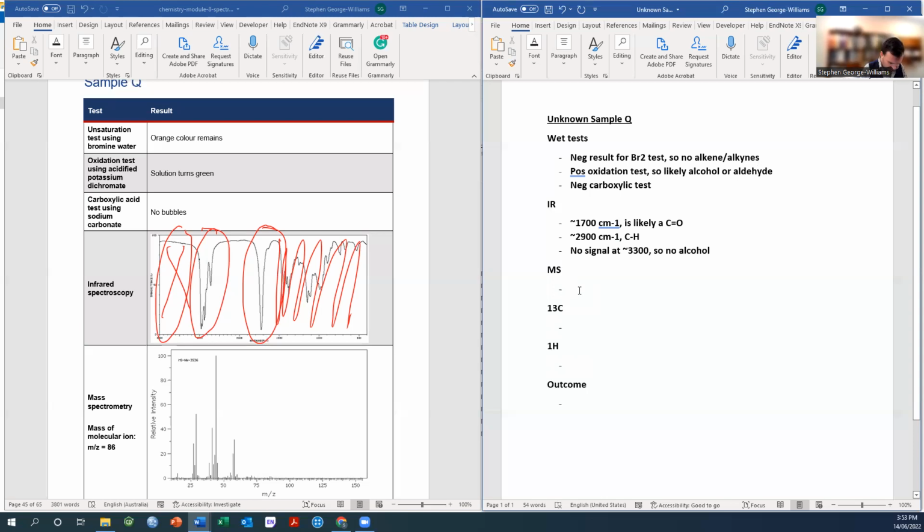Looking at my molecular mass, I know I have a molecular mass of 86. I'm very glad that that was written to the left because good luck seeing in there. And this is a good example that a mass spectrum can, depending on how it is collected, be very unstable. So our molecular ions may not actually survive. So we've been told in this case that the mass to charge ratio is 86.